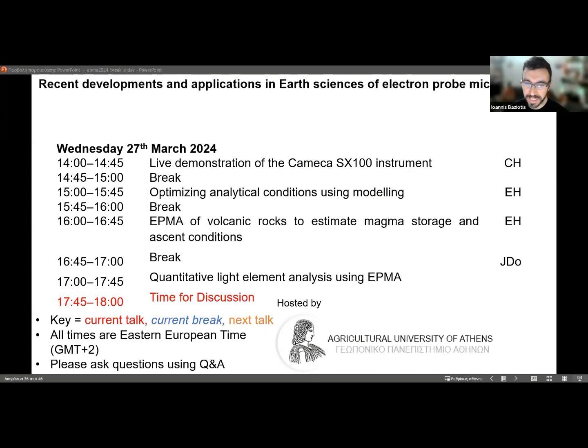Now, we are actually aware that it's really difficult to measure rare earth elements by EPMA technique. So using a software like Probe software, is it easier to evaluate or to have a better accuracy of rare earth elements, especially because of the interferences? What do you think I'm going to say? The answer is yes. Yeah, and the answer is yes, but we need a very longer answer actually to justify more.